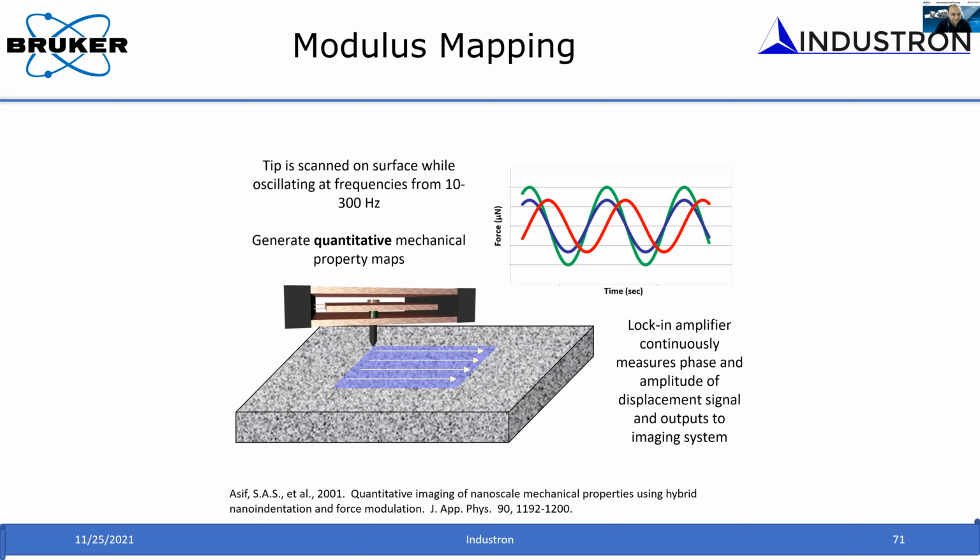A question from Rubia: if cracks are induced during indentation, are the hardness and modulus values we get correct in that case? No, they are not, because some amount of the energy that you are putting into the system is relieved as a crack. So you're going to have some error in your displacement response and the force response. When you have a crack, the energy is dissipated in some other way. So the cracking is going to change how you measure the properties.